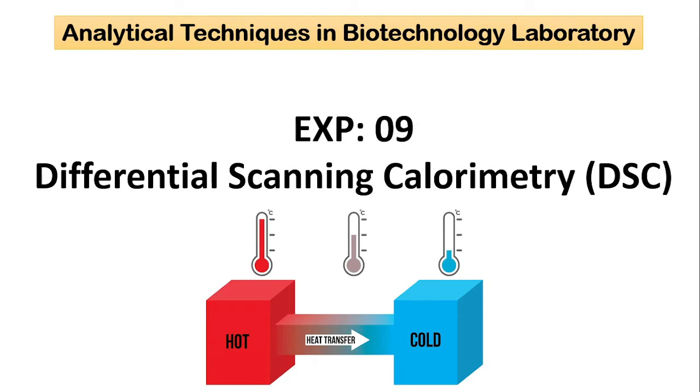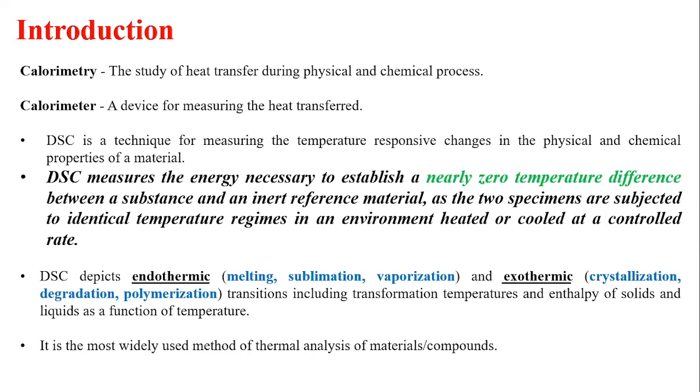Good morning everyone. Today we will be discussing the tutorial and the demonstration of differential scanning calorimetry, that is DSC. Calorimetry is the study of heat transfer during physical and chemical processes, and the device for measuring this heat transfer is called a calorimeter.